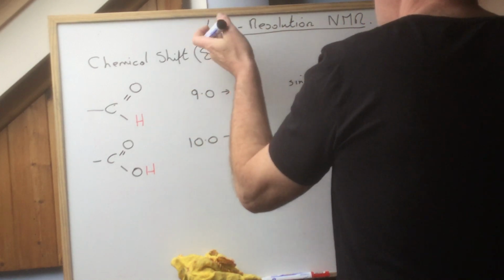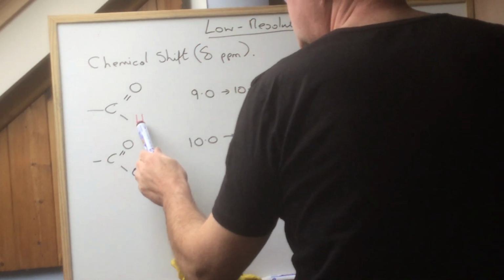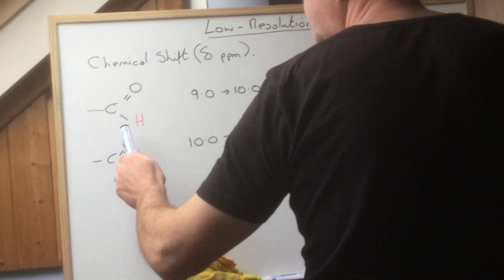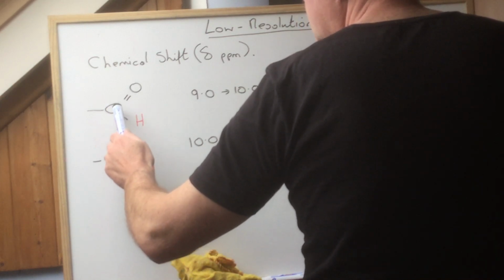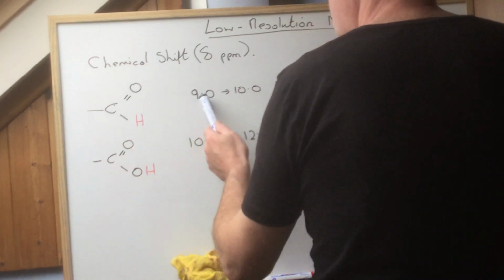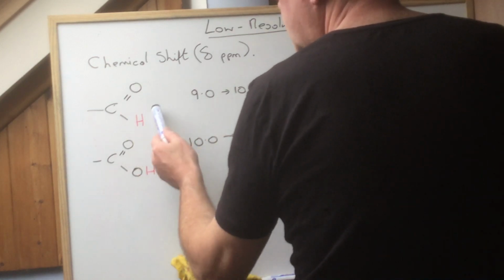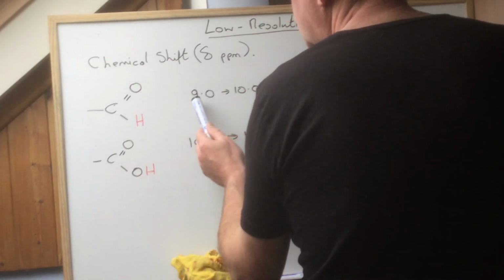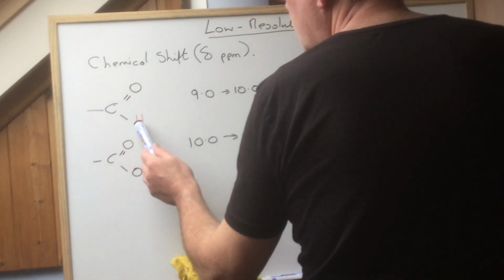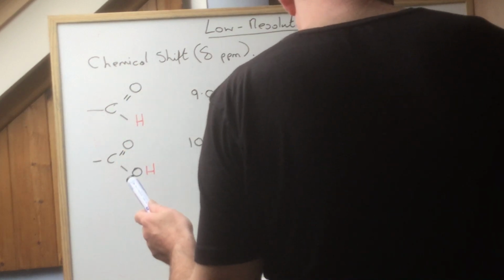in high res NMR, because as you will see, that hydrogen is quite isolated. I say a single peak, we'll have to look at examples, but I don't want to jump ahead here. That proton, if you get something within the region 9 to 10, you pound to a penny have a proton joined to a carbon, joined to a double bond oxygen.